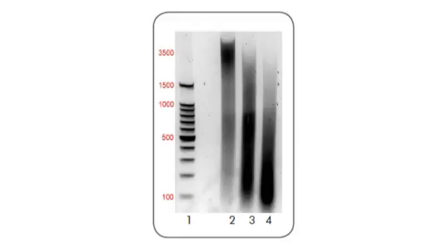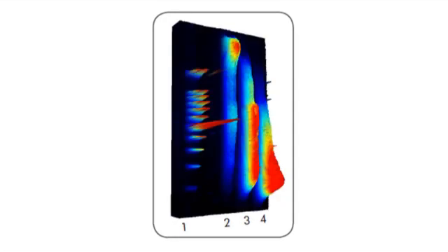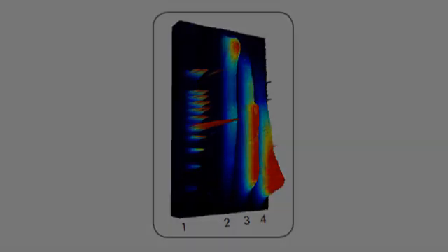Here is an example of DNA that has been undersheared in lane 2, perfectly sheared in lane 3, and oversheared in lane 4. Here is a spectral image of the same gel. Note the even distribution of fragment sizes in lane 3. You can now proceed to the immunoprecipitation phase.